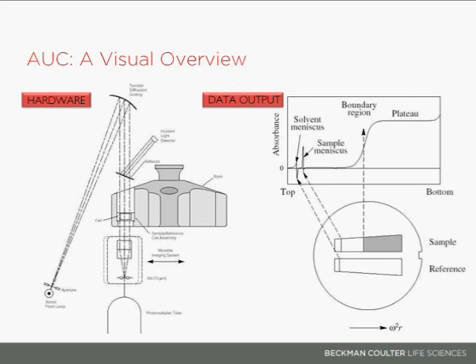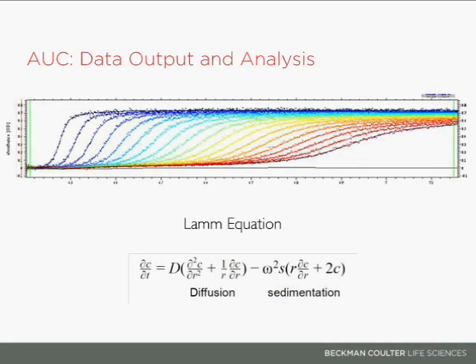Now this is an ideal case. In real life data, you see an output that looks somewhat like this. So this is from real data we collected here using nanoparticles. This was fitted with SedFit. It's a free third-party software by Peter Shook that can analyze the AUC outputs, and there's several other third-party softwares available to analyze the AUC outputs. They're able to be run on your PC or laptop. You don't need a supercomputer.